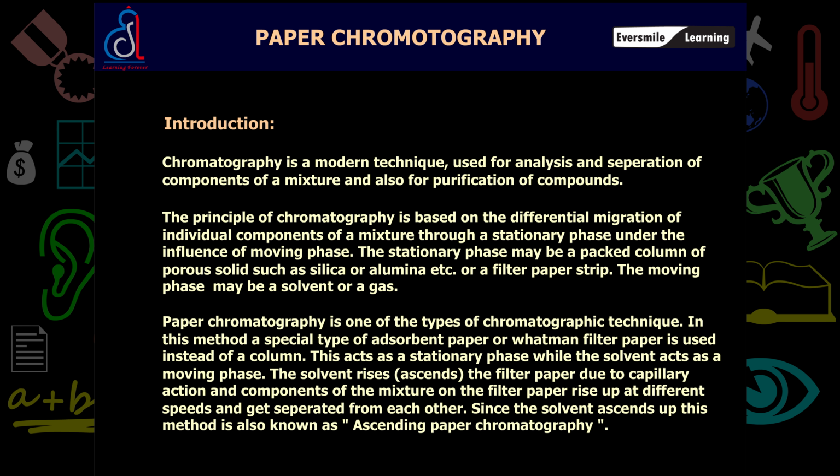The stationary phase may be a packed column of porous solid such as silica or alumina, etc., or a filter paper strip. The moving phase may be a solvent or a gas.